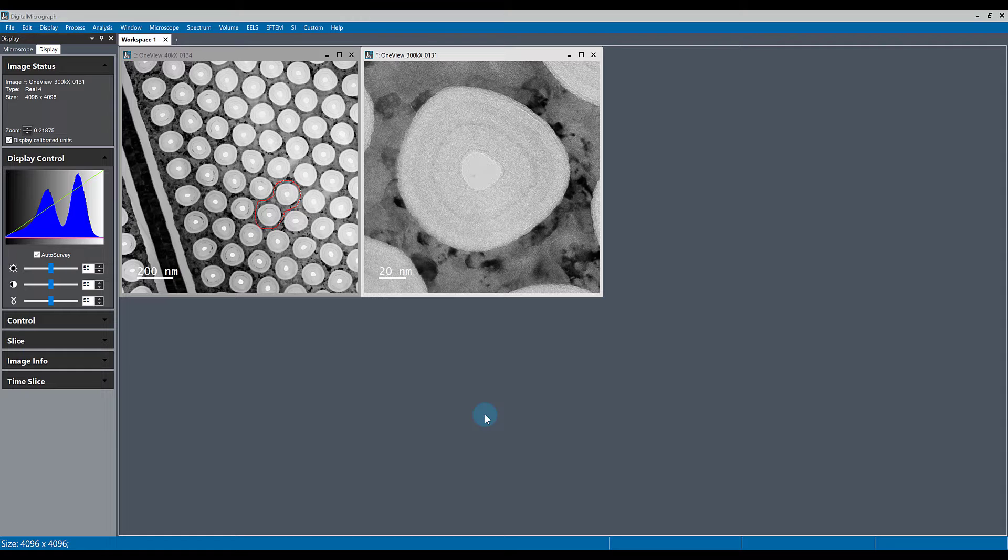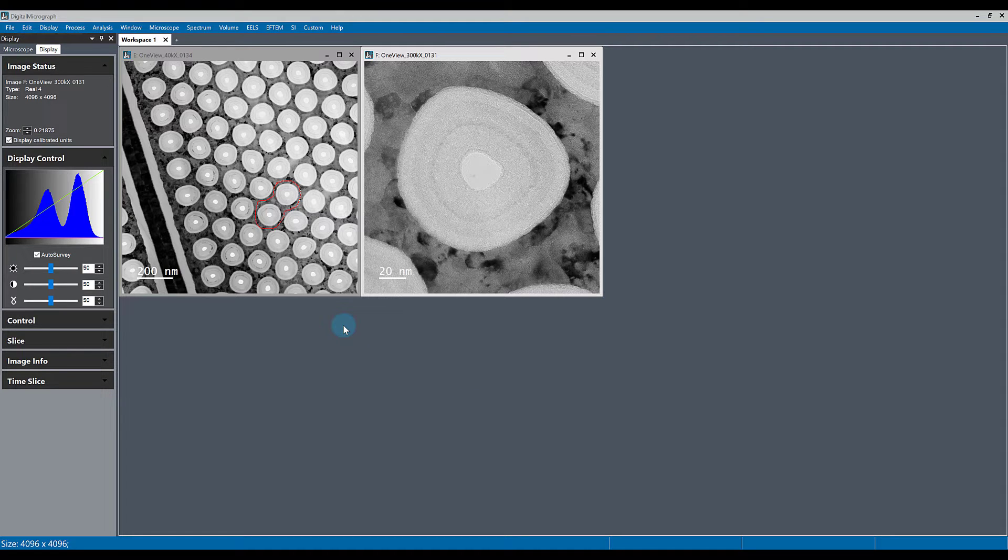If you're ever working with an ROI shape of any shape and you want to cut or copy the actual ROI shape and paste it into the same window or a different window, you can do that.